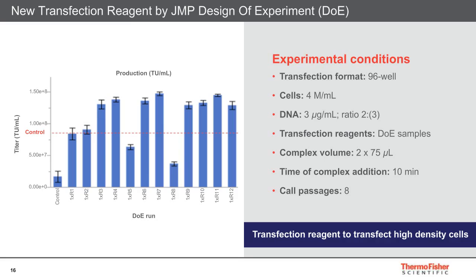For DNA, on the upper right, it's less important. You can see the DNA is a little bit more stable in Opti-MEM, so you have a little bit more time. Other additions also matter, although in this case it doesn't matter too much, but we're also looking at this, as well as the complexation mix, the time you can incubate, and the stability of this complex.